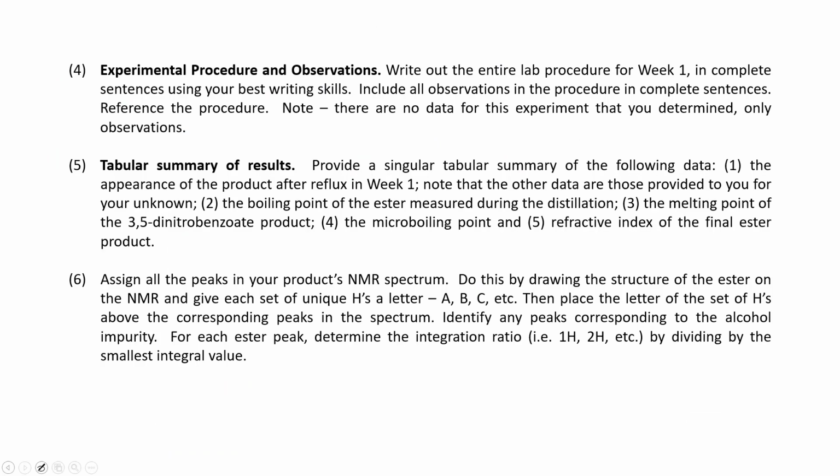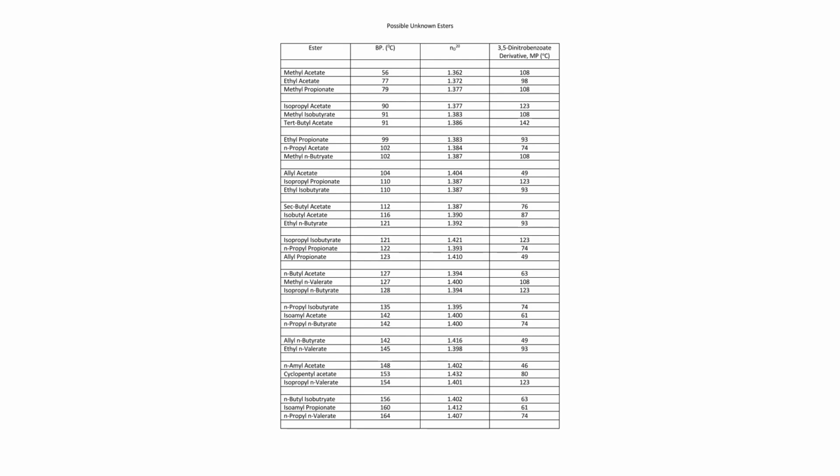So if we go back to the chart, we would find we were looking for isopropyl butyrate. Oh, look at that. I happened to choose correctly in the original range. So there would be isopropyl butyrate. If I got that structure, I'm going to expect a boiling point around that area. I don't know, give yourself 10 degrees.